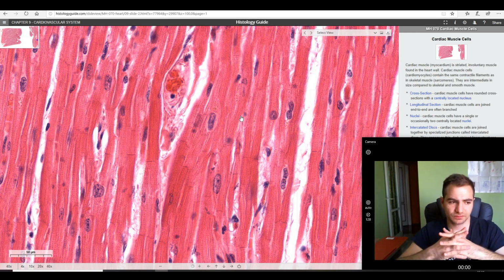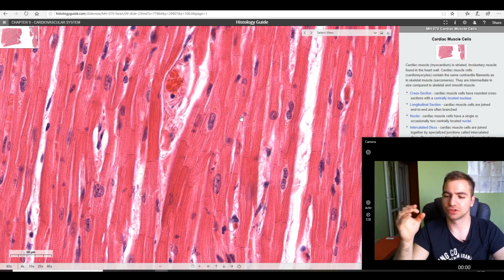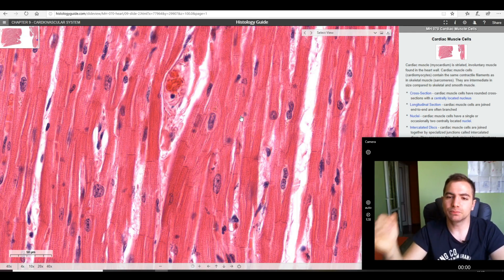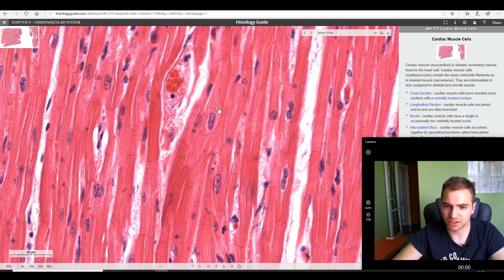We discussed that in the beginning in the cytology, about the tertiary lysosomes. The tertiary lysosomes are the portions of the fused phagosomes with the lysosomes that cannot be digested. This is the end result in a long-living cell. When you don't have the potential to regenerate, it's very common to have these lipofuscin pigments. These tiny holes right here with this brownish yellowish hue are the lipofuscin pigments. This is one of the common findings in the long-living cells.